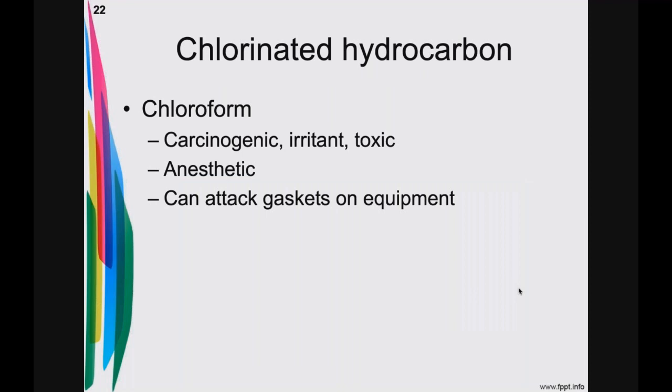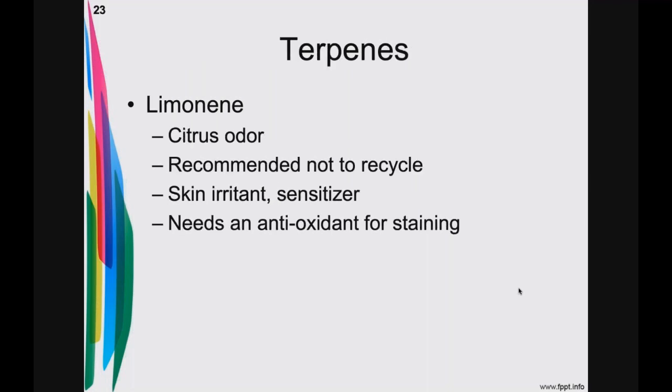The problem with chloroform is it is carcinogenic. We've got dear old formaldehyde in the lab. That's a potential carcinogen we really don't need to add to our health. If your ventilation isn't good, you'll be finding yourself asleep. And making it even more difficult for our equipment, it can attack the gaskets used on the equipment and soften them. So it'll depend upon your manufacturer. Some have given permission for chloroform on the machine. A great deal of them have not. And like I said, this is the only chlorinated hydrocarbon that's still available because the others have really been ruled out because of their destruction of the ozone layer.